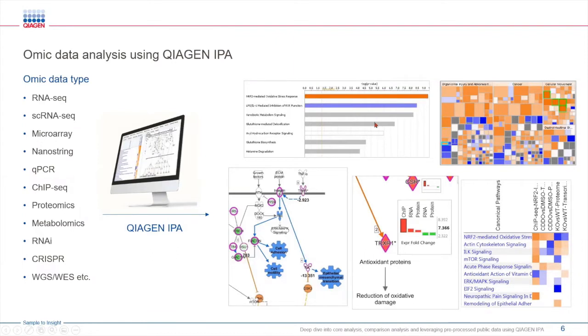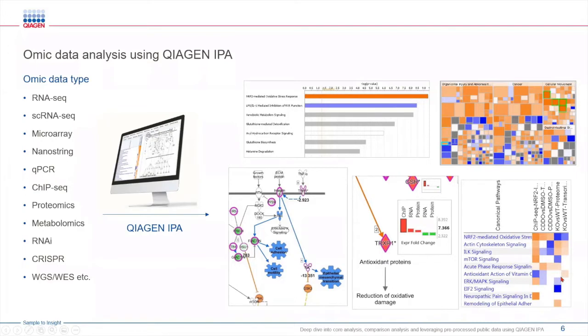IPA can also identify biomarkers, key regulators that are associated with your data set. And you can also compare multiple data sets side by side to observe similarities or differences within those experimental conditions.